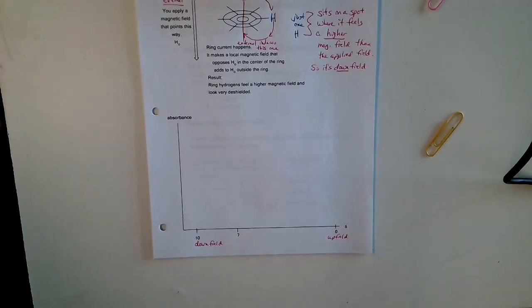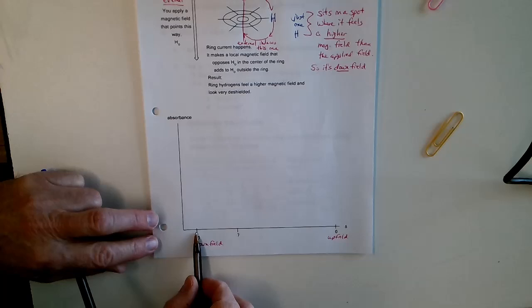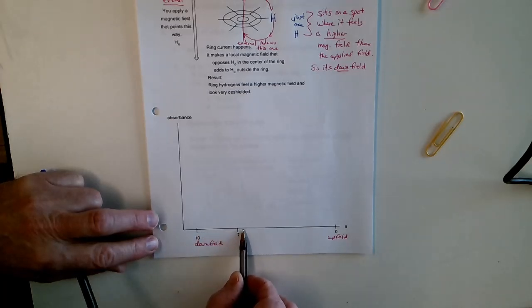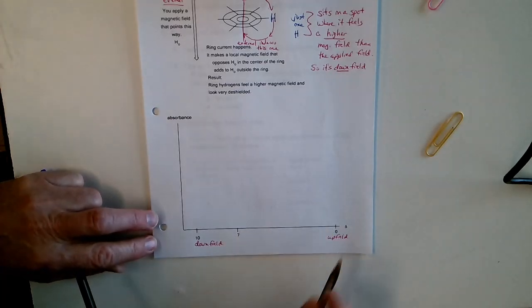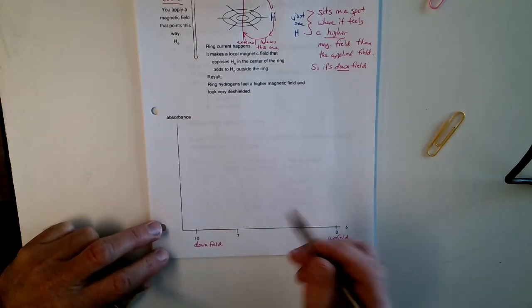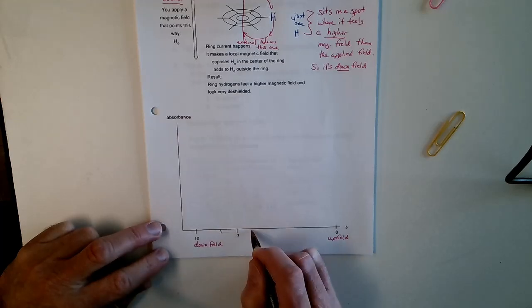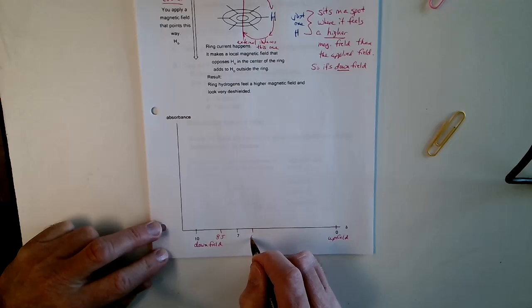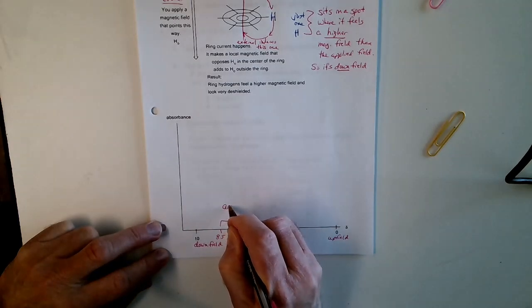Think of it as, actually you're changing the frequency, but think of it as changing the magnetic field strength, so you're cranking it up as you move left to right. A little bit stronger, until finally you get to where you flipped all of those protons. Well, what you've done is the aromatics, which are, I'm going to say 8.5 to 6.5. I've seen them that high. So that whole zone right there is where you can expect to see the aromatics.